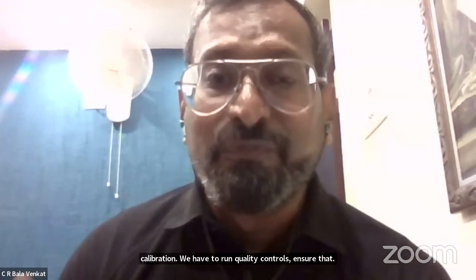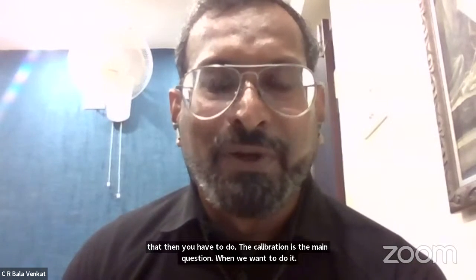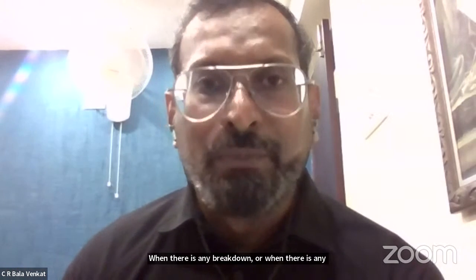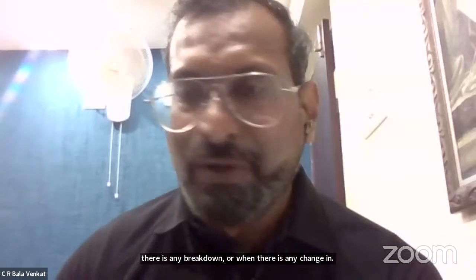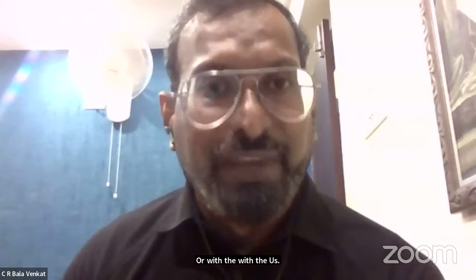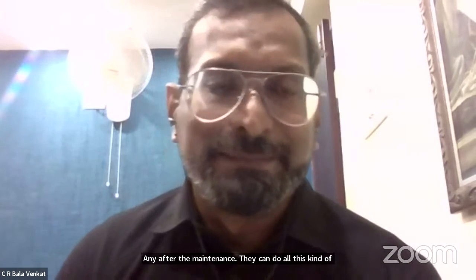So when we have to do the calibration is the main question. When we want to do it: when there is any breakdown, or when there is any change in reagents, or when they have any problem related to the machine, or after the maintenance, they can do all these kinds of things with calibration.